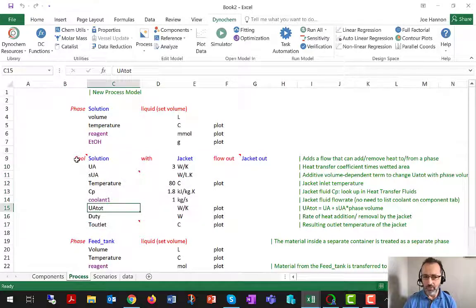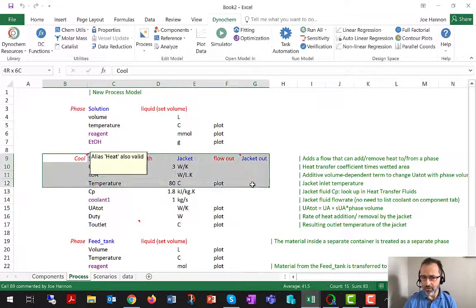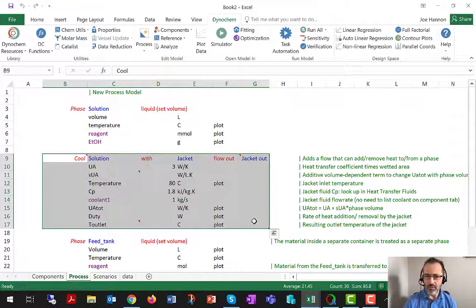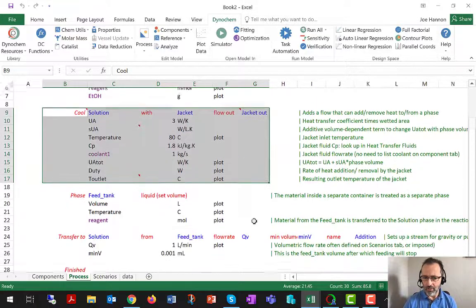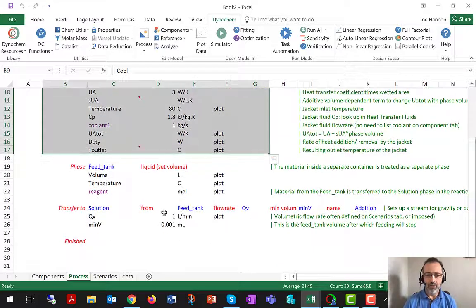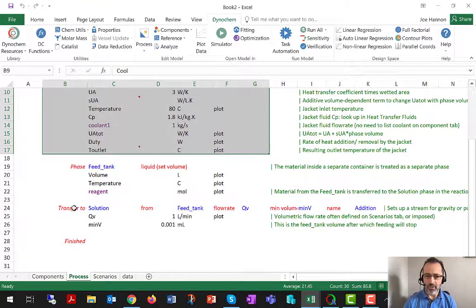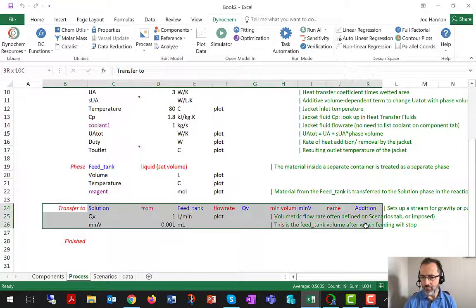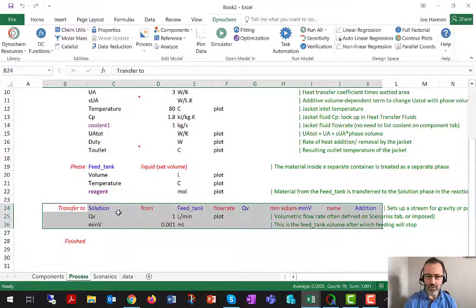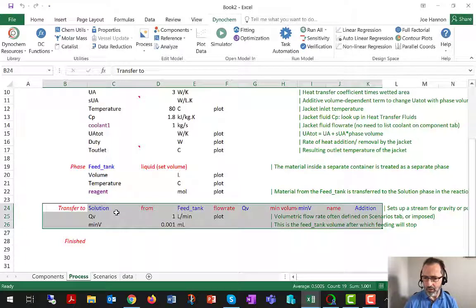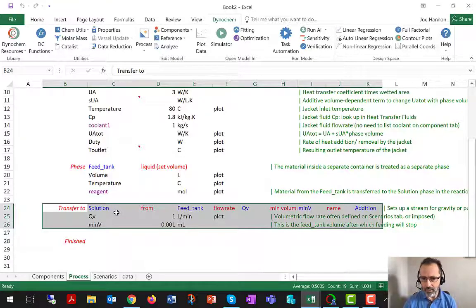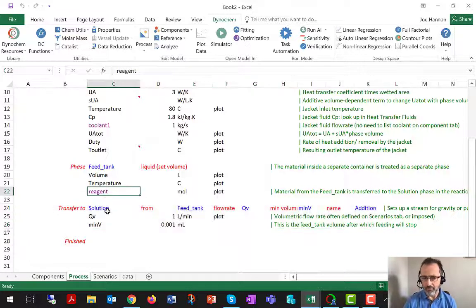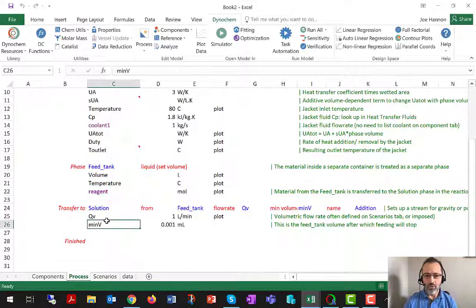For example, the cool statement is going to add a UA times delta T log mean. The transfer statement is going to add a QV times the concentration of material in the feed tank to the rate equation for reagent.